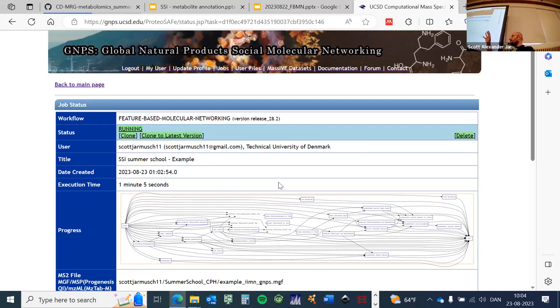Correct. It's private to your account. So no one, yeah. So the question was, any of the data that's uploaded into your server file, is it private? And what are the other files that are present?